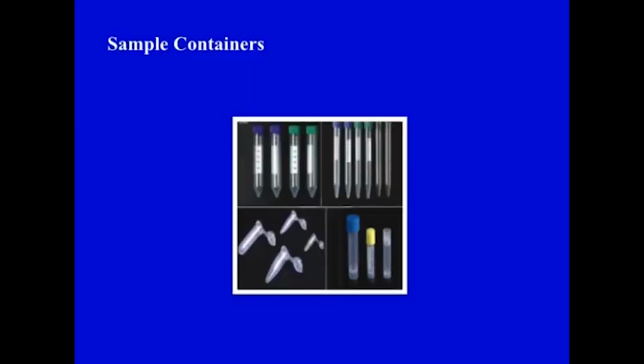All right. The sample containers used, like centrifuge tubes or bottles, are manufactured in a range of different sizes, from a few ml to a liter or more, with varying thickness and rigidity and from a wide variety of materials.